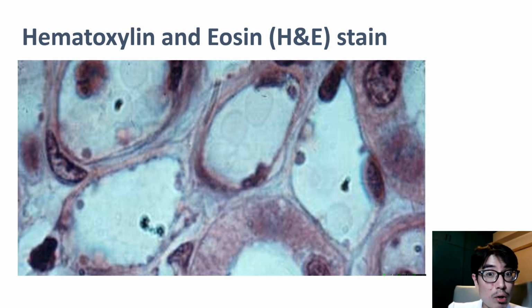Hematoxylin and eosin or H&E is the most common laboratory stain. Hematoxylin is a bluish purple dye, while eosin is red. Nuclear chromatin has a high nucleic acid content and therefore is attracted to the blue, more basic dye. That is, it is basophilic. Everything else in this picture is relatively neutral in character and takes a wash of eosin.